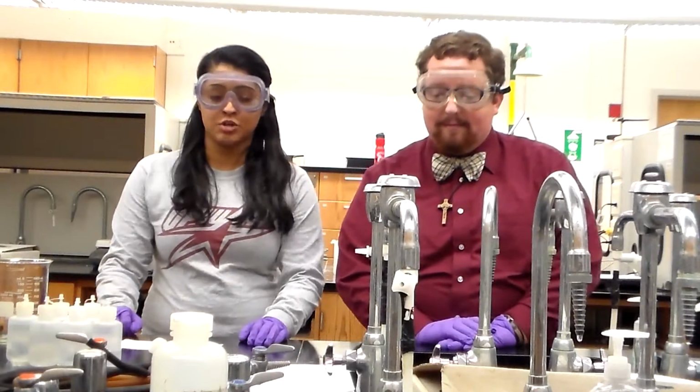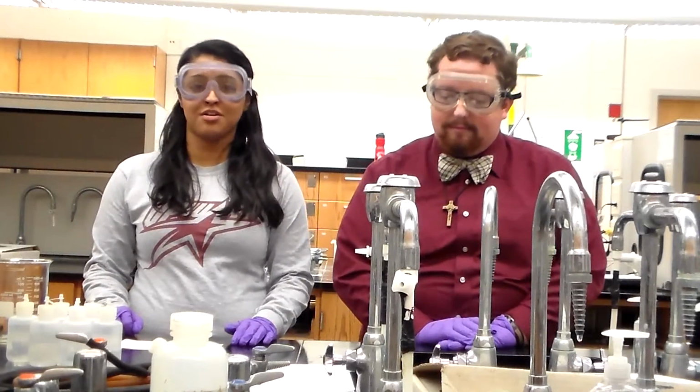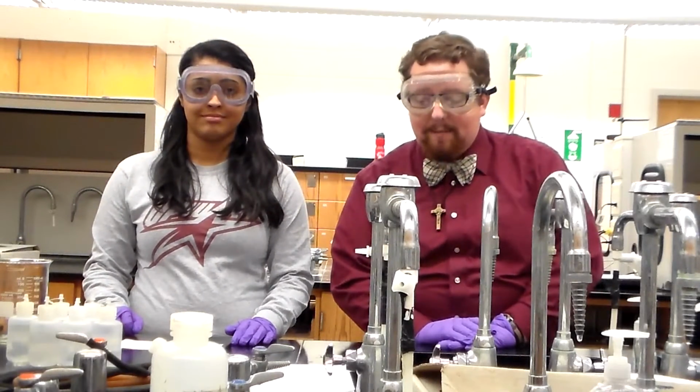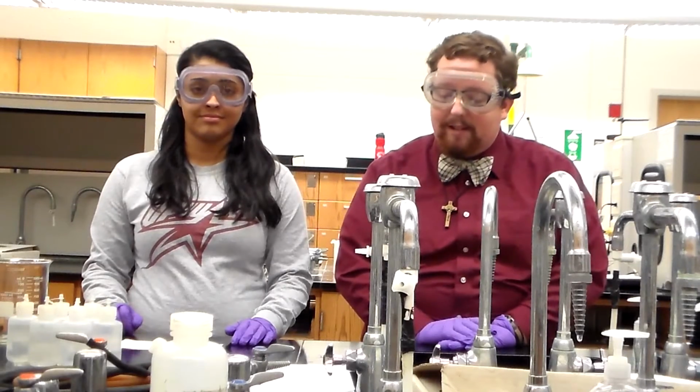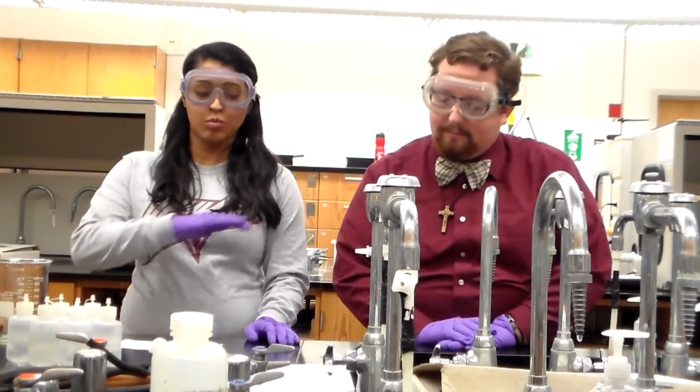In today's lab, you will be determining the identity of unknown amino acids by using paper chromatography. Chromatography is a method to separate mixtures based on their differences in affinity for the mobile phase and the stationary phase. The mobile phase is solvent that will move up the stationary phase, which is the paper.